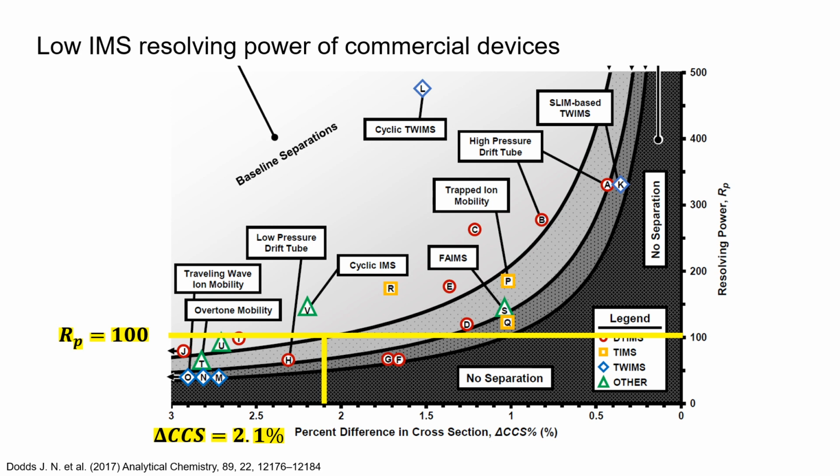For the drift tube technology, increasing the resolving power can be achieved by building longer and longer drift tubes. So one could potentially build a 1 kilometer drift tube for an outstanding separation. However, in addition to the band broadening due to the diffusion of the ions in a wider time frame in the time dispersive instrument, the problem is that the longer the drift tube, the higher should be the potential difference for keeping the working electric fields typical of drift tube instruments. And this has practical complications both from the electronics and safety standpoints.